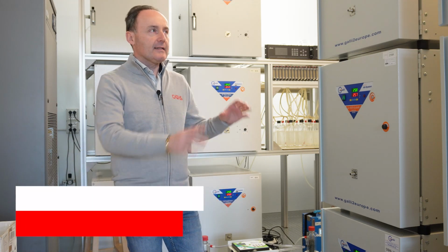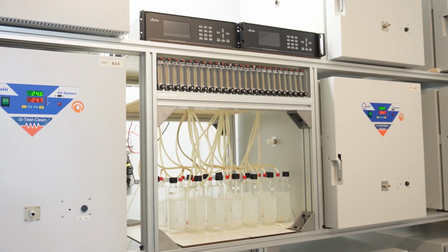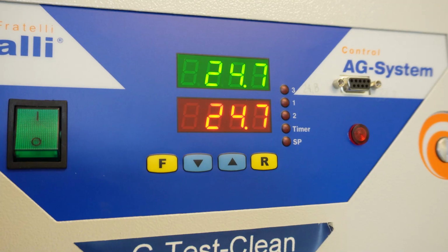We are now in the test cell. You can see this equipment. It is called testing rooms or chambers. They simulate the living conditions of a real home or environment. They are made of steel. Inside there are constant temperature and humidity.